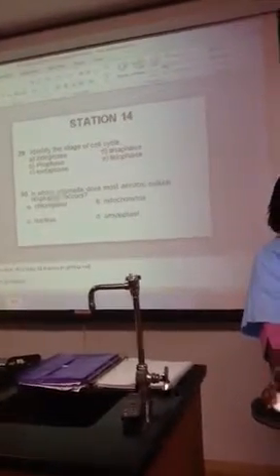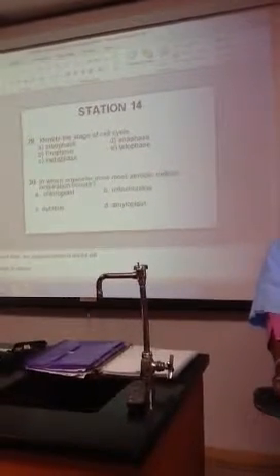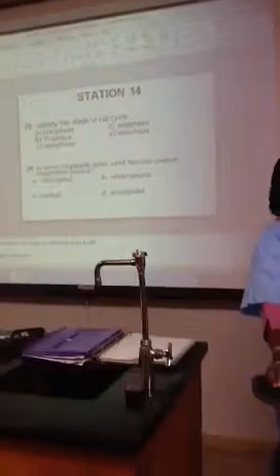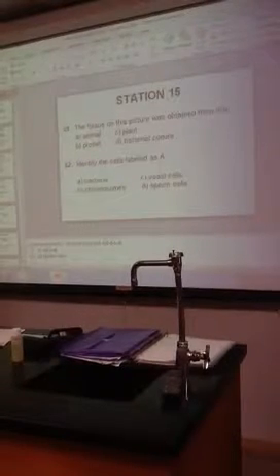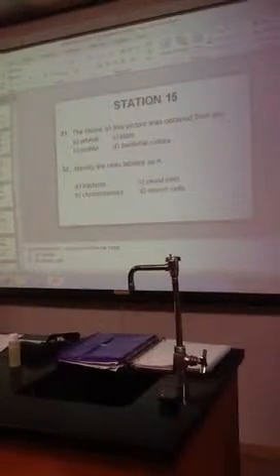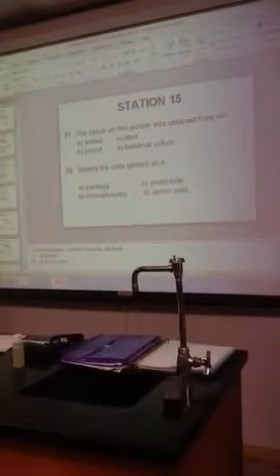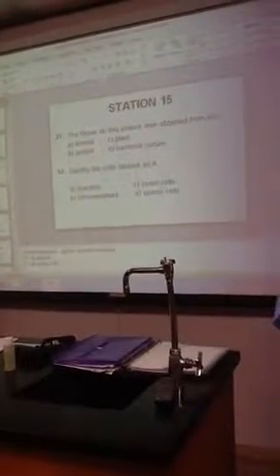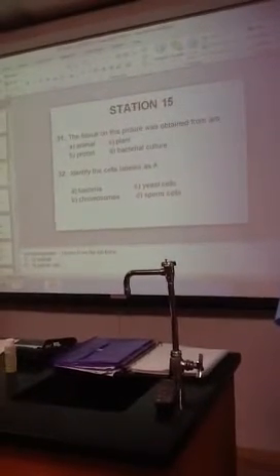And again, identify those things. In the cell organelles, you know all this stuff. You know what a mitochondria looks like and chloroplast, right? Nucleus. Chromosome, bacteria. You should know what a bacteria looks like. Of course, you should know what a sperm cell looks like, and you should know what a chromosome looks like.